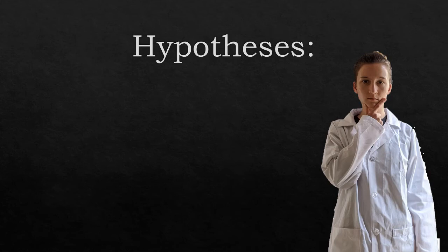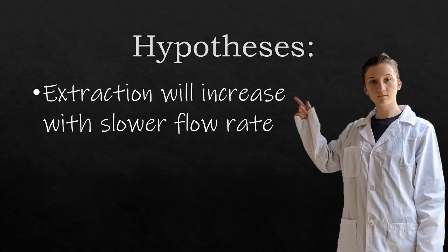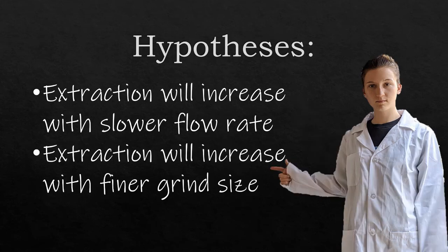The hypotheses of this experiment are that extraction will increase with slower flow rate due to higher residence time of the hot water with the coffee beans, and extraction will increase with finer grind size due to increased exposed surface area of beans for the caffeine to transfer to the hot water.